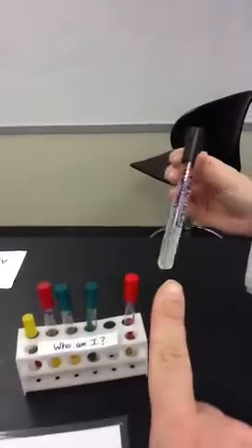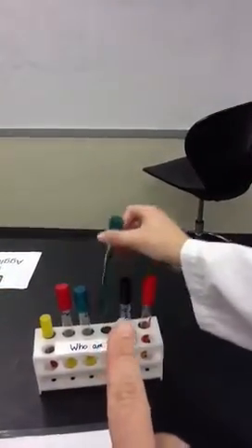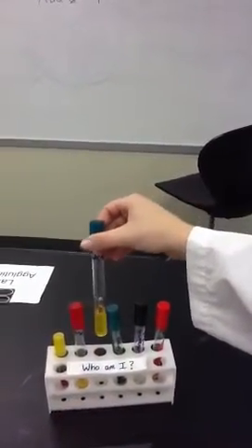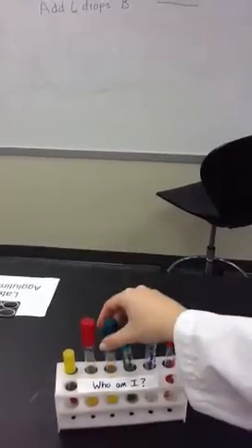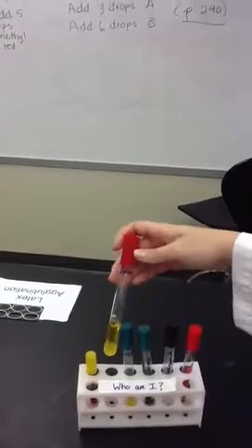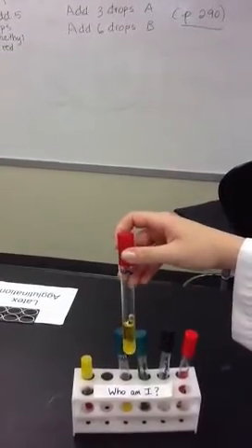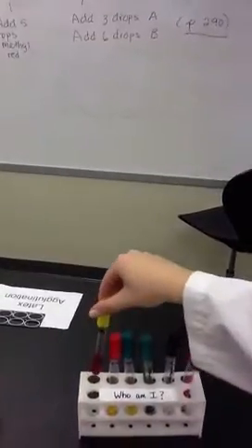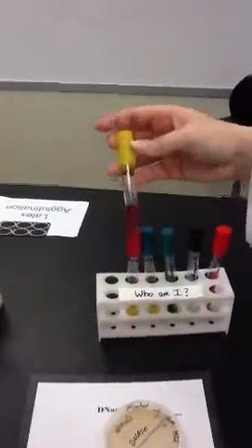I know that because mine had one. This is a TSI agar. TSI agar. That is just a slant. That is citrate negative. Correct. That is... Wait, wait, wait. Lactose positive for acid and gas. Carbon dioxide gas. That is glucose positive for acid, positive for gas. And then that is... what the hell is that?